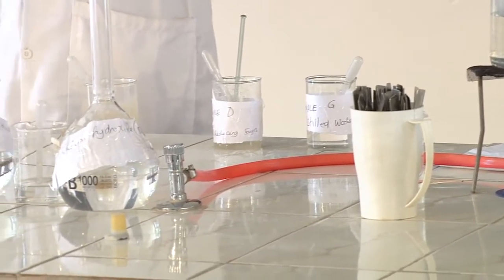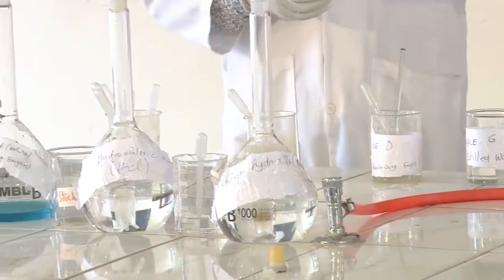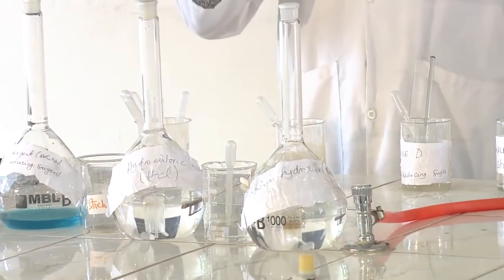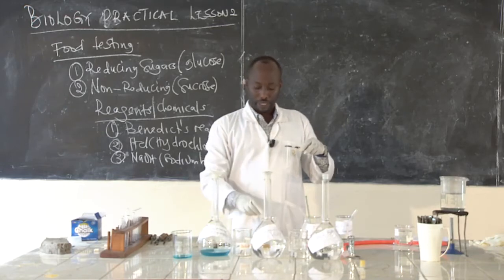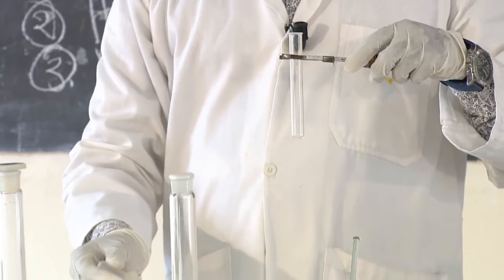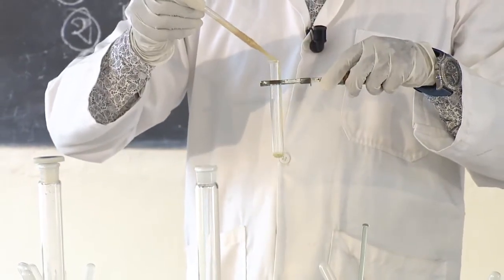All right, let me put on the gloves to protect myself. So from there, I'm going to get a sample. I will use an equal amount of the solution. You get like 2 centimeters of the solution, and you put like 2 drops.